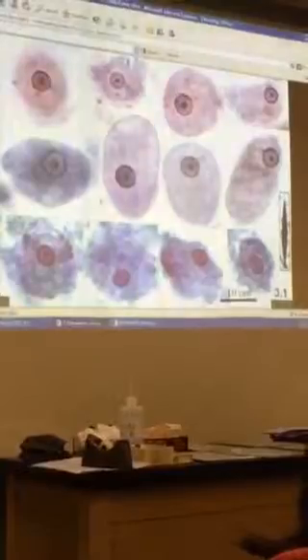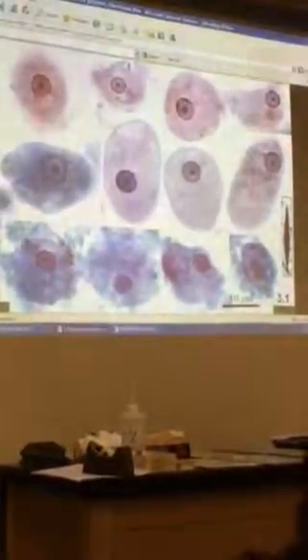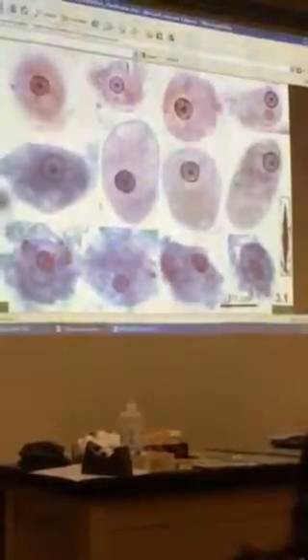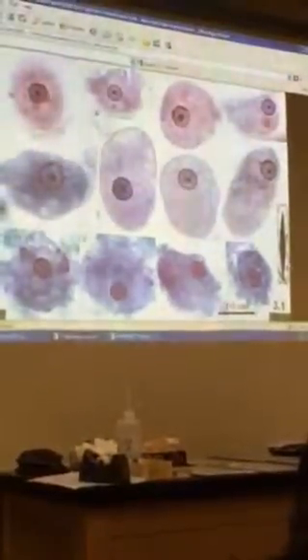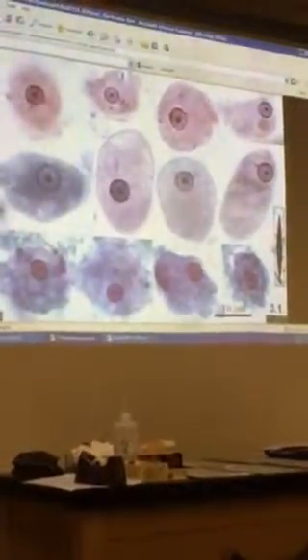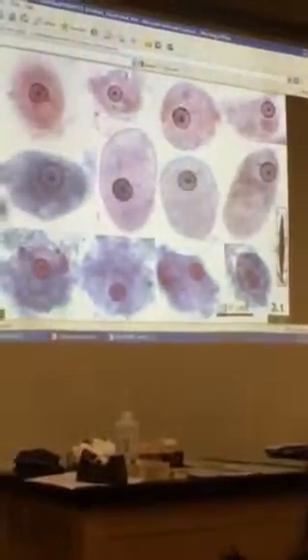So if you happen to see that, I'm not promising you that the one I put on the practical will have that. But if it does, that is a diagnostic characteristic. Also, sometimes the Entamoeba histolytica will have these Charcot-Leyden crystals. See if it says that somewhere.